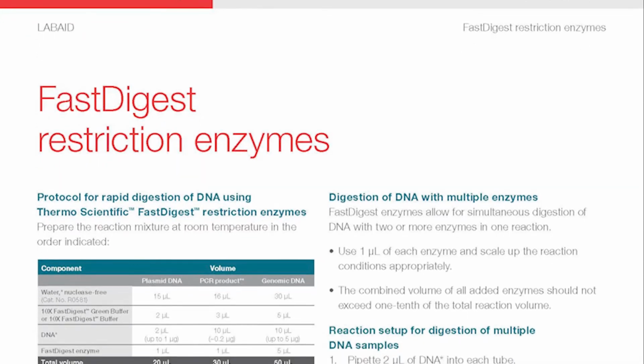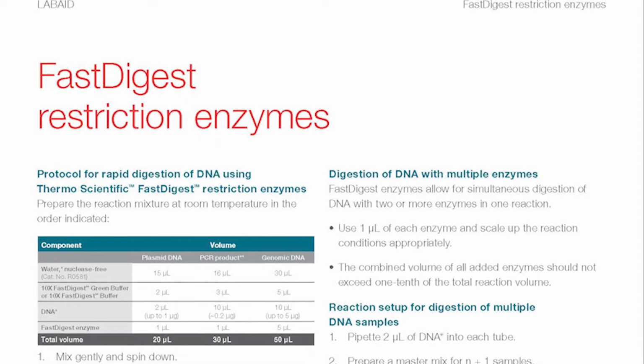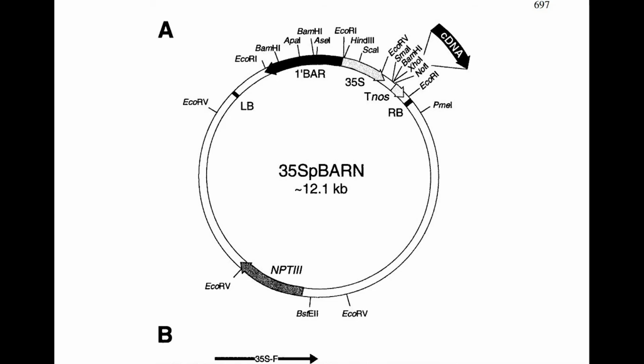These are also done using proprietary enzymes, so you will have to look up the right protocol. Let's say we choose enzymes EcoR1 and Hind3. They will cut your vector at those three positions.